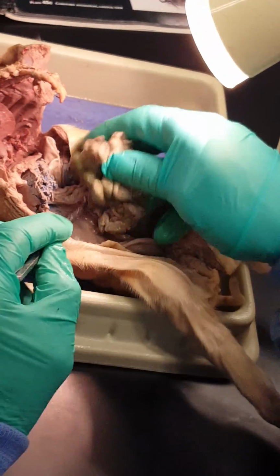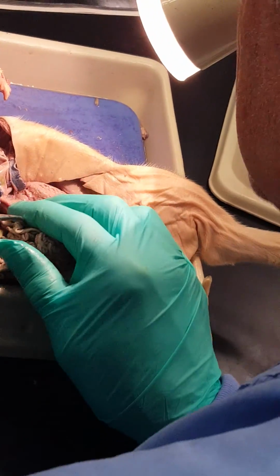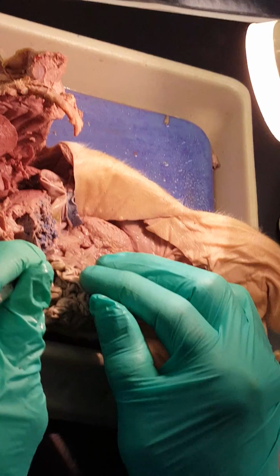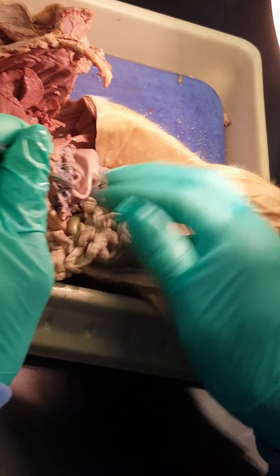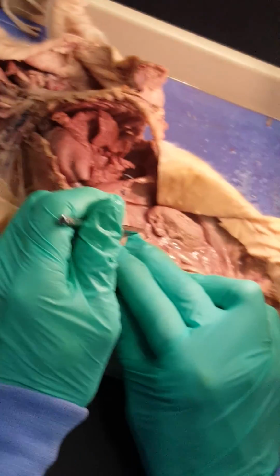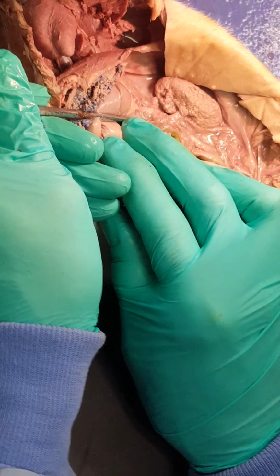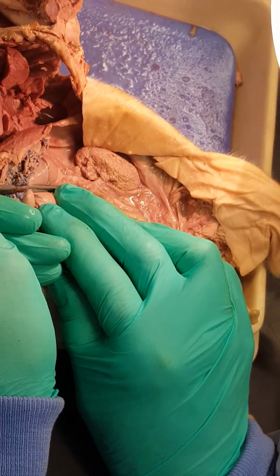Now, these viscera are all hanging in what we call the mesentery. And so the next splanchnic artery to come off from the dorsal aorta, here's our celiac, is this one. And it's called the superior mesenteric artery. Okay.